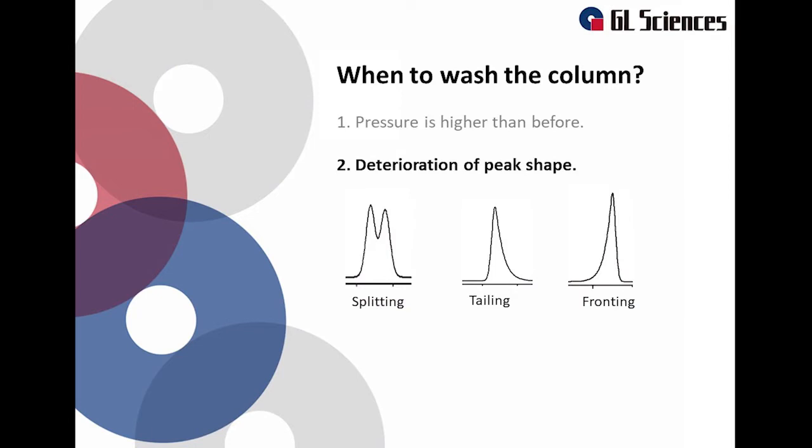The second case is when the peak shape deteriorates. Examples are split peaks, tailing peaks, and fronting peaks. These symptoms can be caused by dirt being adsorbed on the column. This can change the retention. The target component can be adsorbed by the dirty part. In this case, we have to wash the dirt from the column.